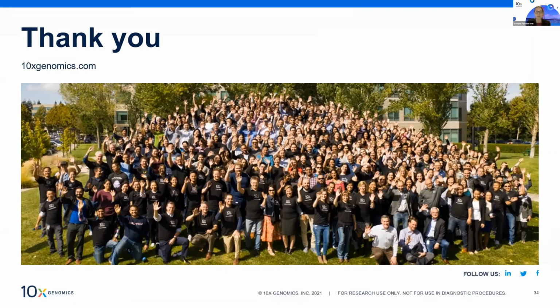So that's coming out shortly, as well as in situ, although in situ is a bit further away. That's another year, around another year. But that as well is going to be very exciting. So we could probably have a separate seminar on that once we can share more data.